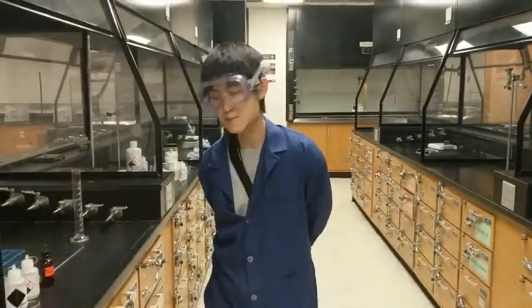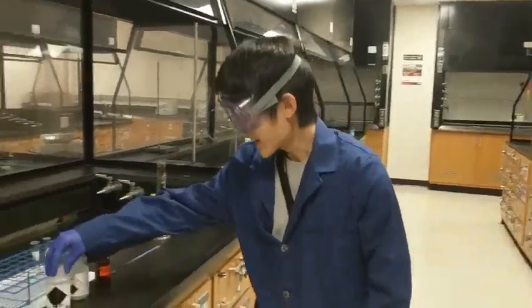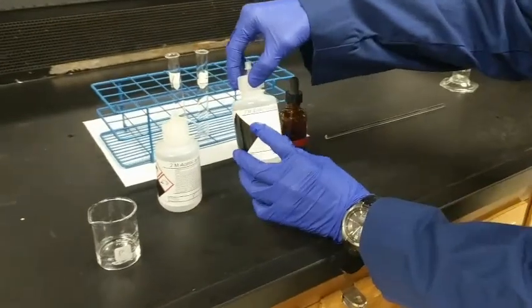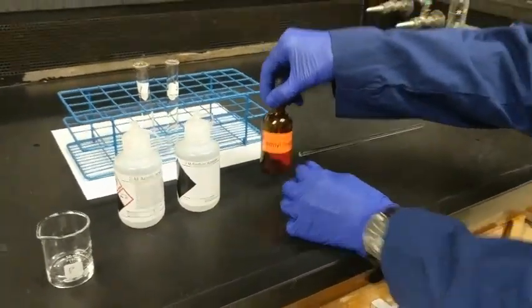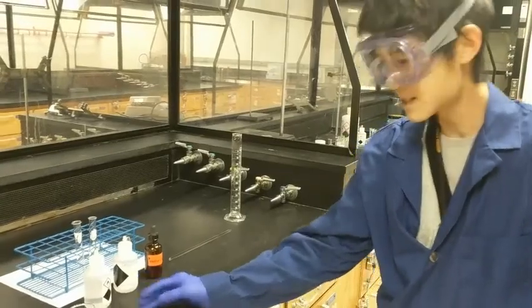In Part 4 of this experiment, we are going to control the ionization of the weak acid, acetic acid, by adding its conjugate base. So we have 2 molar acetic acid, 2 molar sodium acetate, and methyl orange indicator. Please note that each solution is colorless.